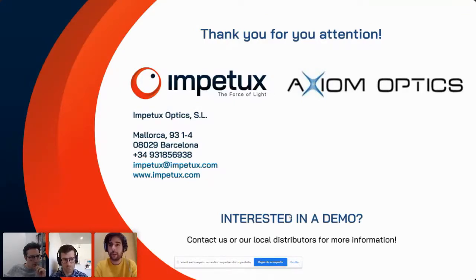Okay. Great. And there was also a question from Kaushik regarding the force resolution and also the accuracy of the position of the optical tweezer. And you say the force resolution is in the order of femtonewtons? Yeah. So the resolution is femtonewtons, and position resolution is in angstroms. In terms of precision, what you can measure depends. Resolution is the minimum step you can measure. In terms of what you can actually measure, taking into account sources of noise, etc., typically it's in the order of 0.1 piconewtons and 1 nanometer. That's more or less the scale where we are.